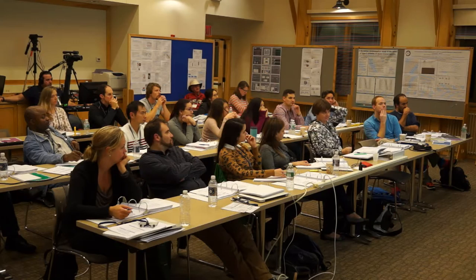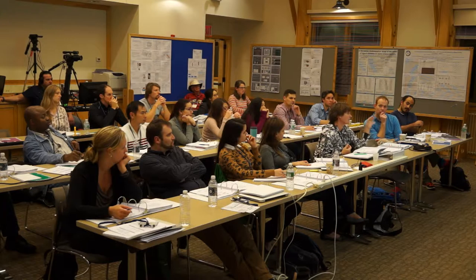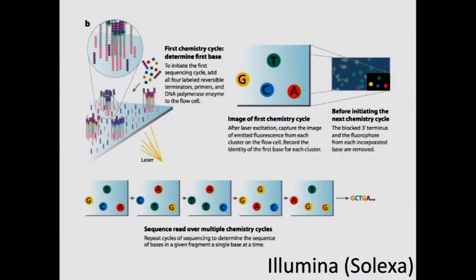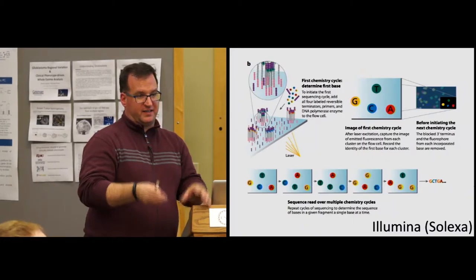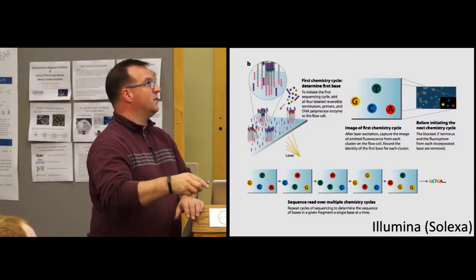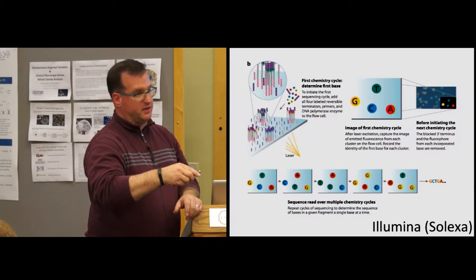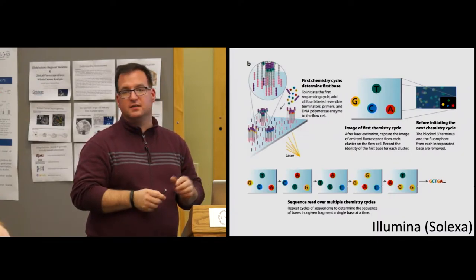Yeah, one read, but maybe I'm using the wrong linguistics: does the size of the so-called colony reflect the number of strands? It is the number of strands on there, yeah. But essentially what we want to do is make the spot big enough that the image recognition software can see it, but not so big that it starts to bleed into the next spot. And this is a kind of density issue, right? The more densely you can spot that slide, the more reads you're going to get for any given reaction. We could have pipetted this at a much lower density, with only one spot in this given area, and that's fine. We get one read, but that's a lot of wasted real estate. Good question.